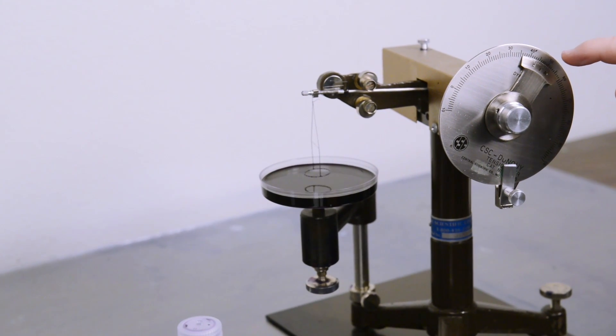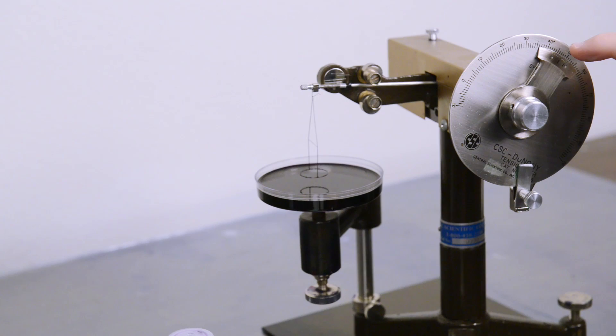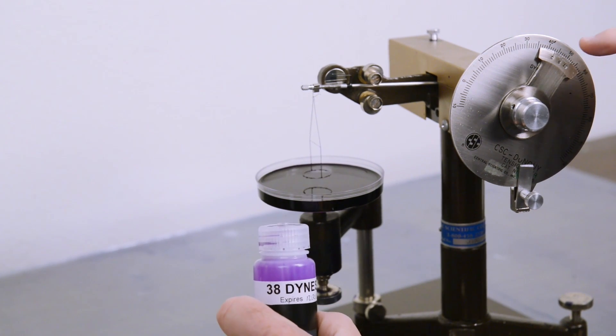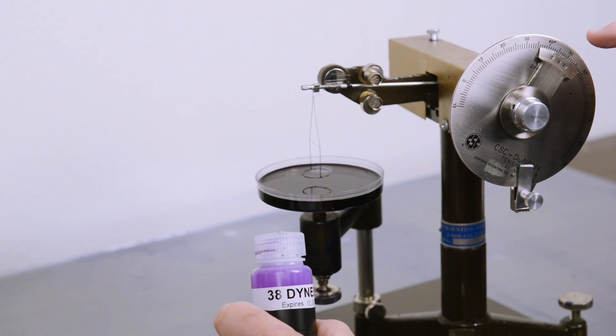And as you see, there is a showing, it is always one line below the level, and there is a 43, so it is actually a 42. So theirs is at least four Dines higher than the Dine solution that they advertise.